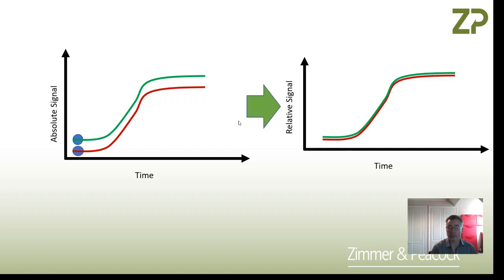So in that kind of situation, one fix is to not show absolute signal, but think about relative signal. In this data, there's a flat region, which is the initial baseline, and then the signal takes off and then plateaus again. If you change into a relative mode where you express all your data relative to the flat region, that should take care of the sensor variability and leave you with just the true signal from the analyte of interest.